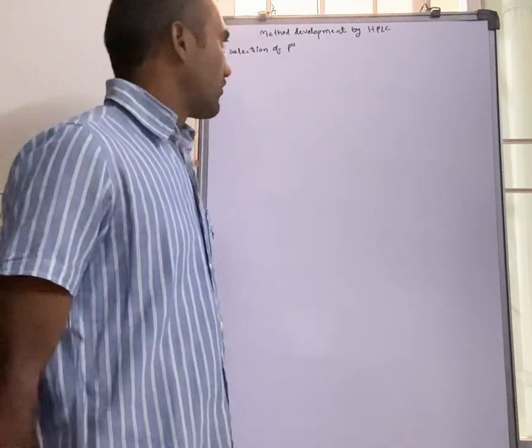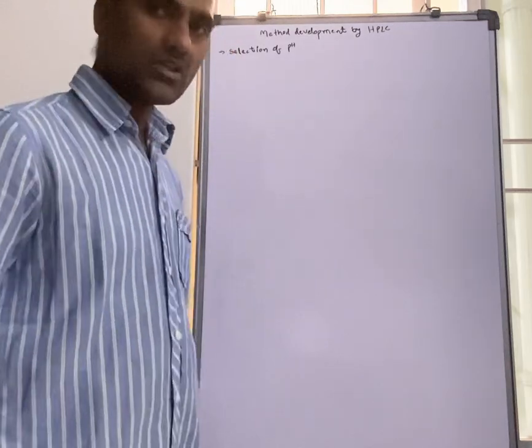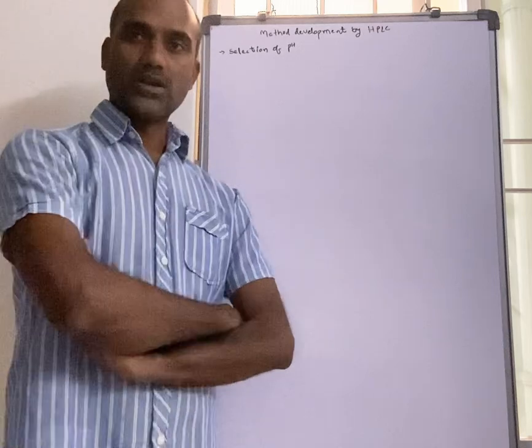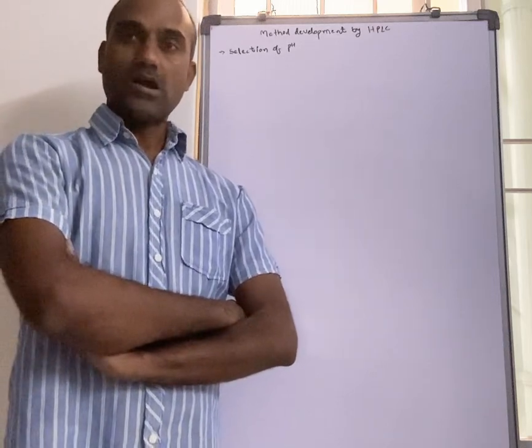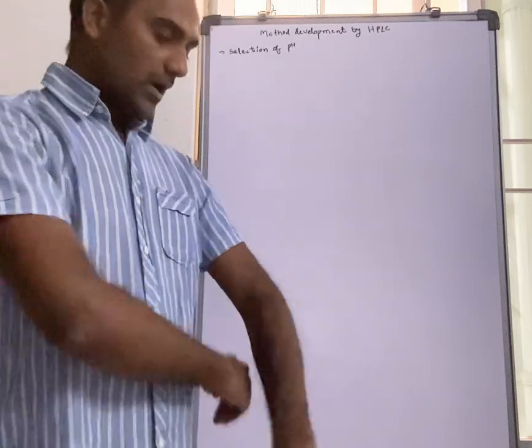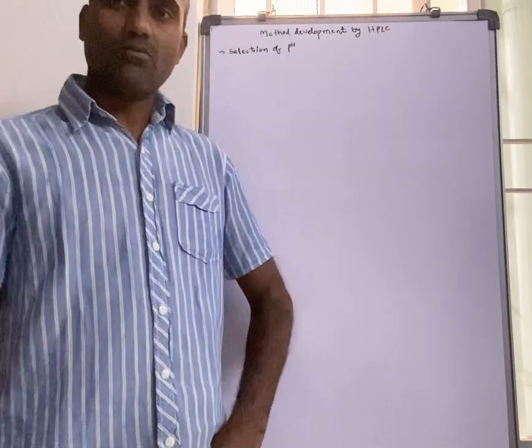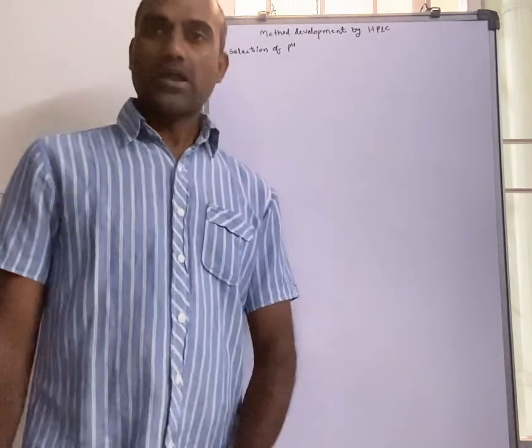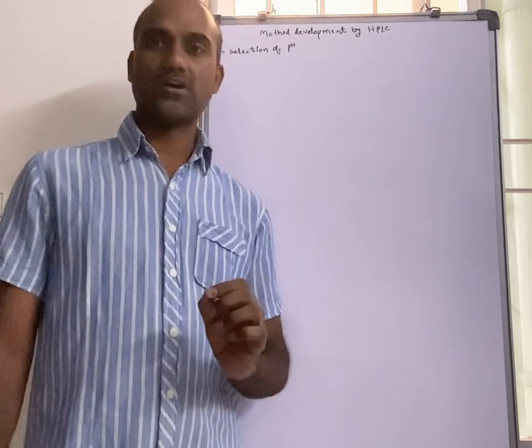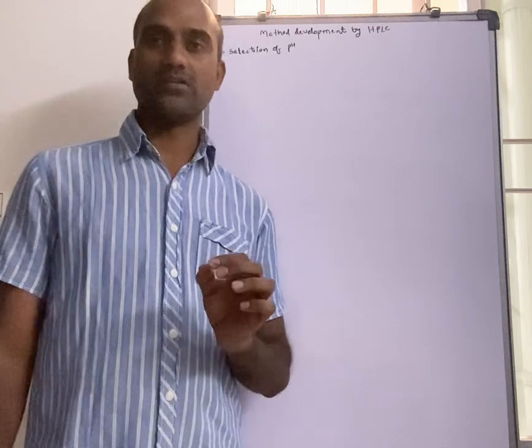So for this, first we want to know about selection of pH. Before going to this, just remember 2 points. One is, for acidic molecules use acidic mobile phase, and for basic molecules use basic mobile phase. Why? Because acidic molecules will not dissociate in acidic environment, and basic molecules will not dissociate in basic environment.